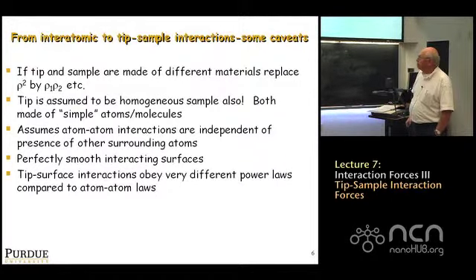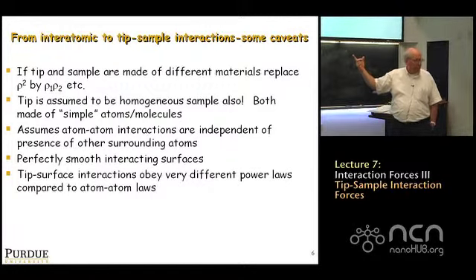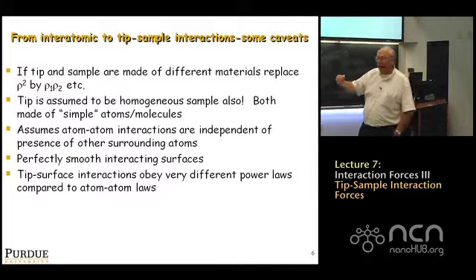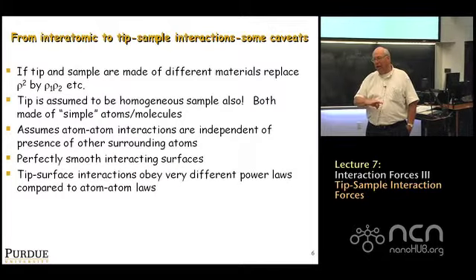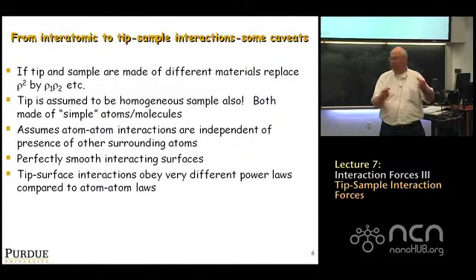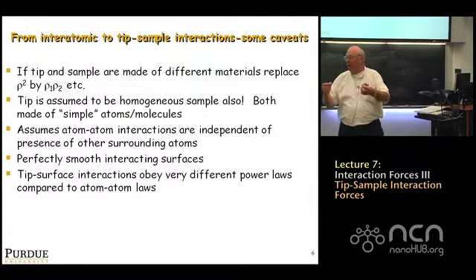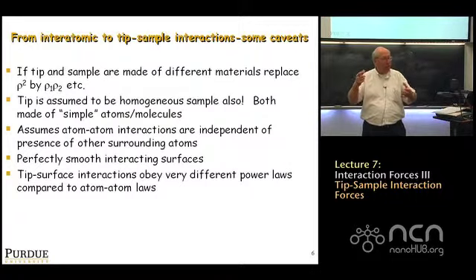And the other thing that's really evident is that these tip-surface interaction energies obey completely different power laws than the interaction energies between, let's say, two atoms or two molecules. So the atom-atom or the atom-molecule interaction was a 1 over r to the 6th.